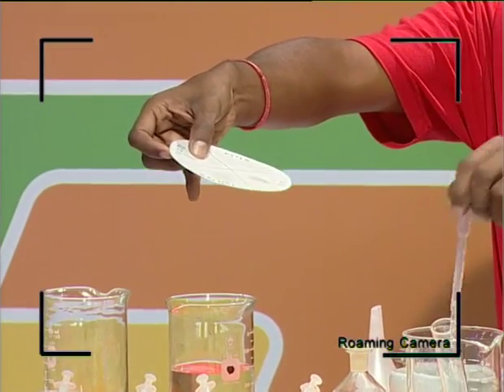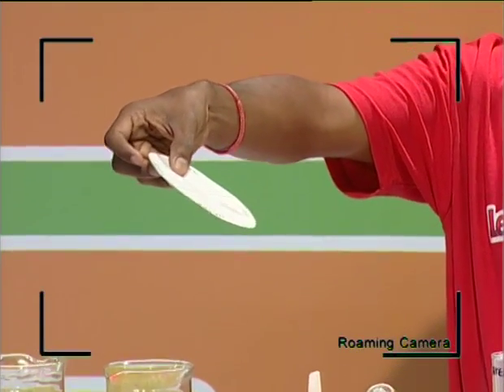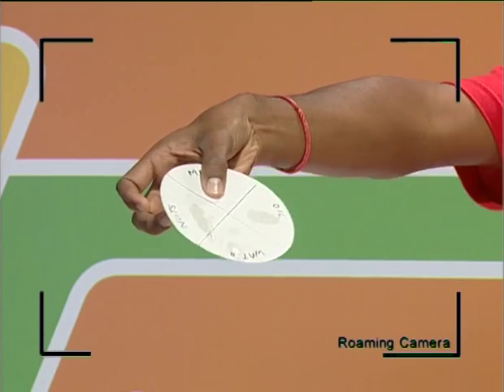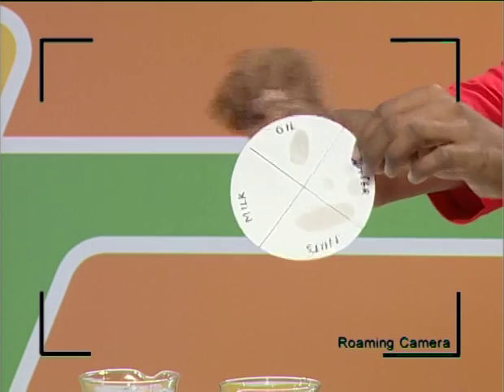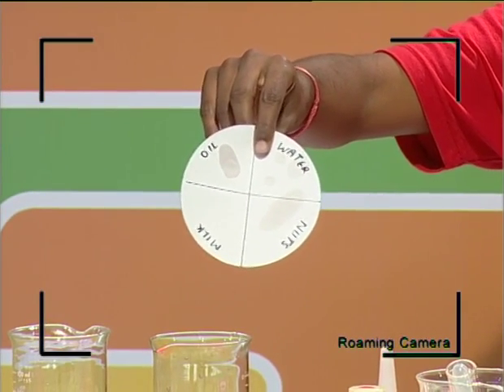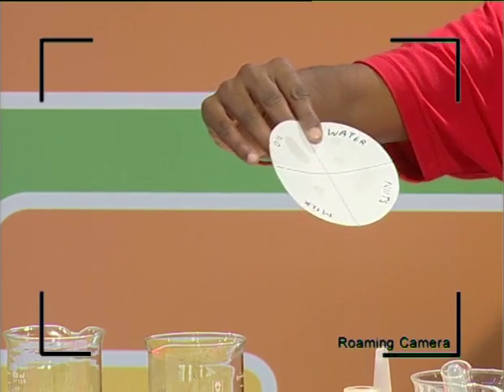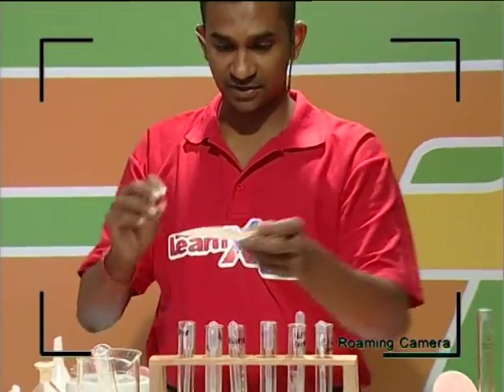Okay, then I'm going to move on to peanut butter. Okay, that's nuts. So let's see, where's our nuts? There it is here. So that's the nut. Okay, we're going to drop a nut. Oh, too many. And then the next sample is milk. So we're going to milk here, guys. Okay, we have milk here. Okay, so you can see a little drop of milk in there. So we're going to leave this to evaporate and dry a little while, and we're going to move on to the next.